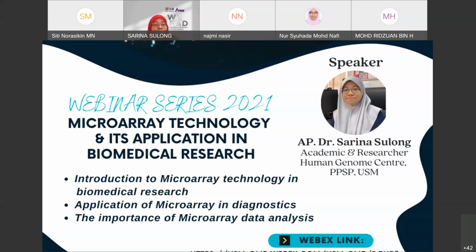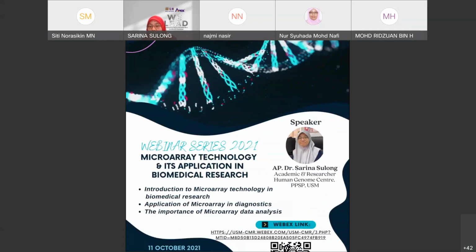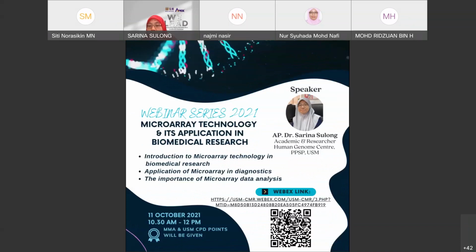Okay, we have a question in the chat box. Can I read it for you? Okay, it's from R.I. Samia. The question is, what is the difference between NGS and microarray in terms of clinical application? Are they complementary or different?